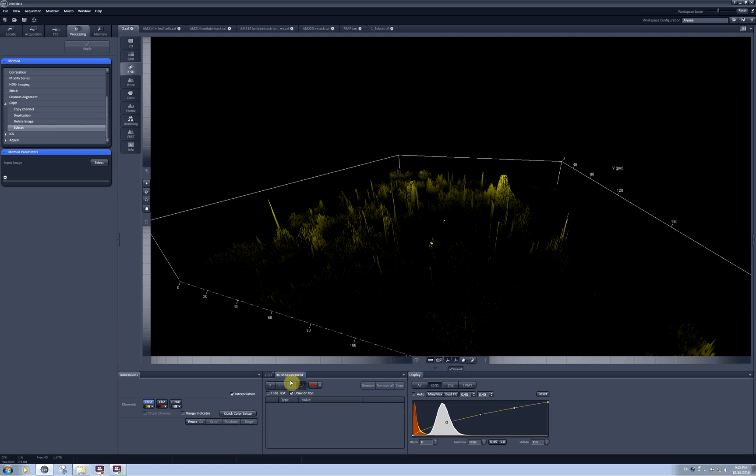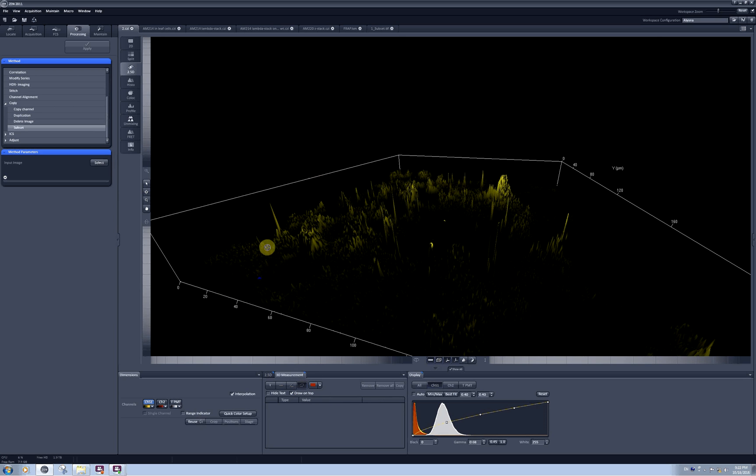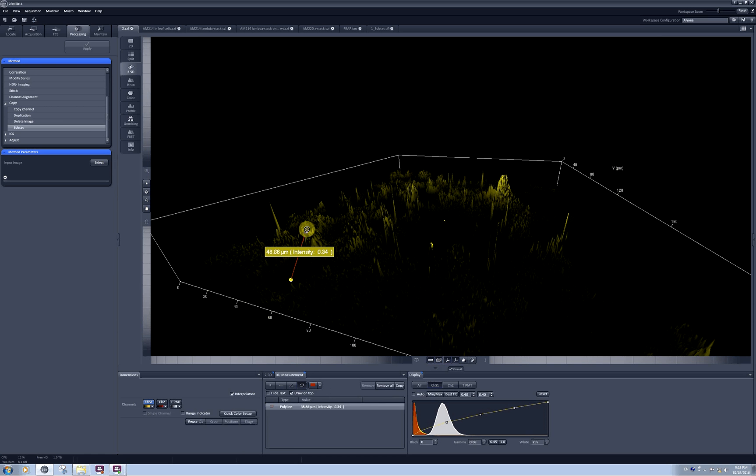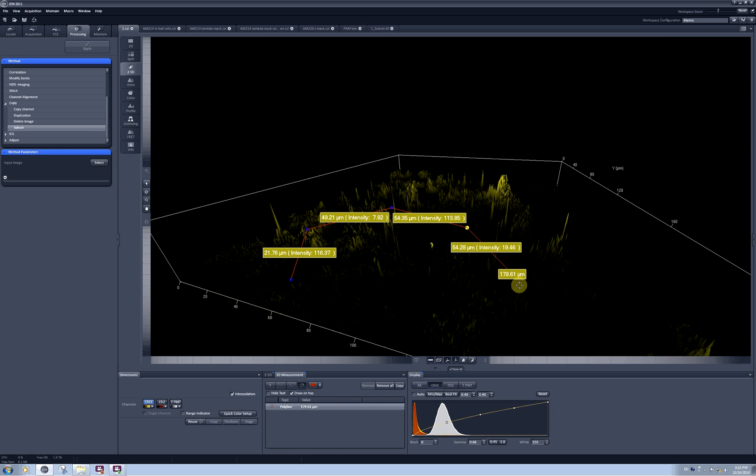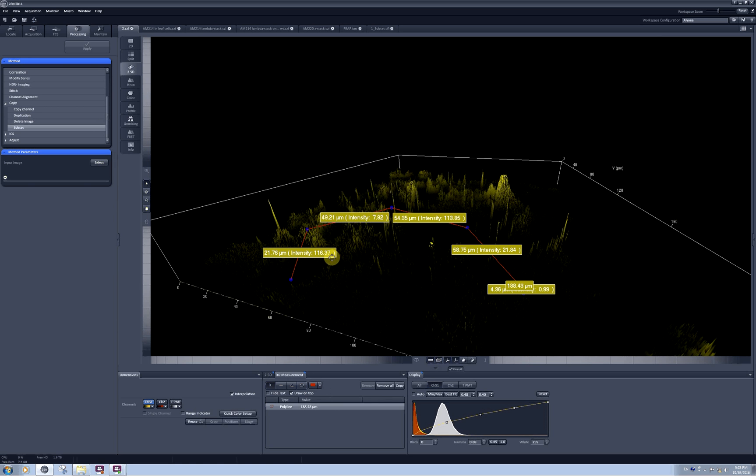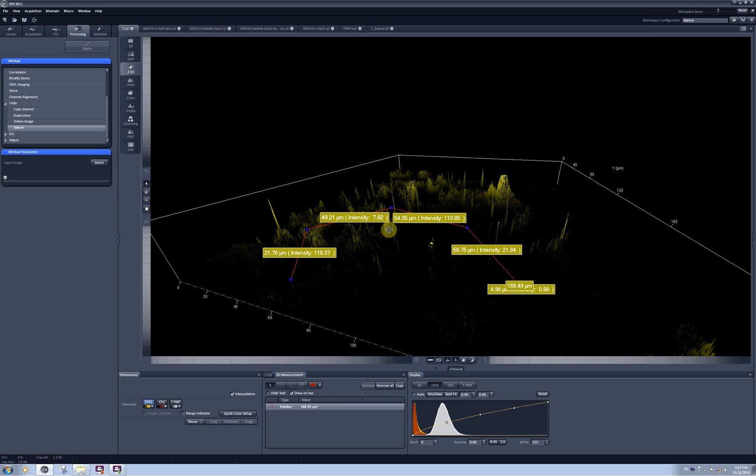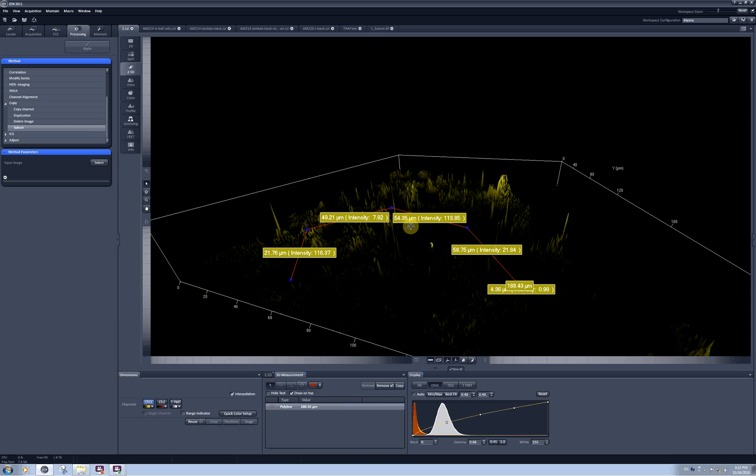There is also a 3D measurement tab here which allows you to measure intensities, for example, along a polyline which you can draw on your model and it doesn't always work. Here I can see the intensity at this point will be 116 and at this point it will be 7.82 and so on.